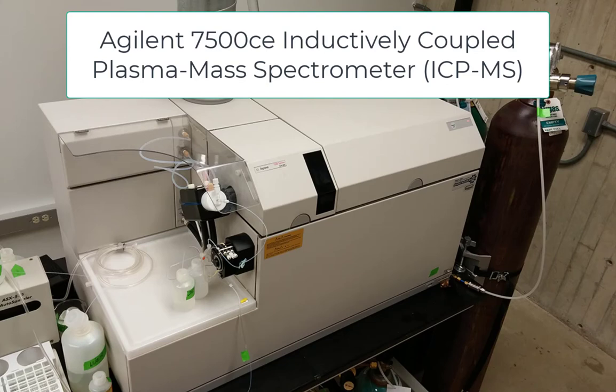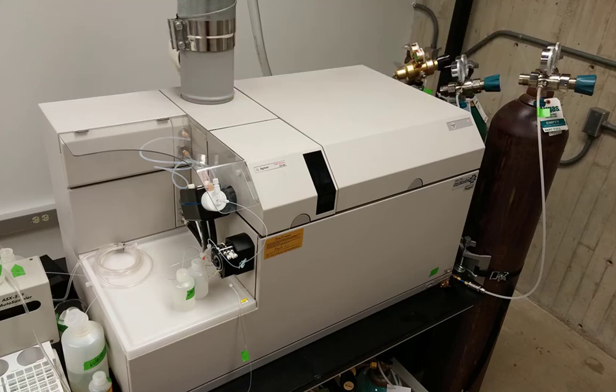Welcome to the Agilent ICP-MS introduction video. Today we're going to talk about our Agilent 7500 CE inductively coupled plasma mass spectrometer, or ICP-MS. We're going to do a quick overview of how the system works, not going into a crazy amount of detail, and then we'll do a hardware overview video.